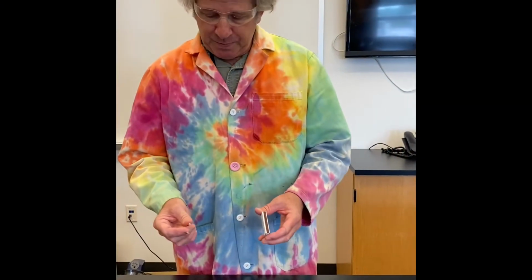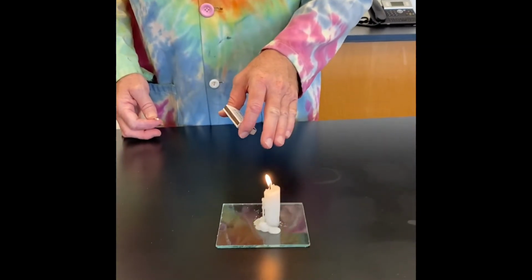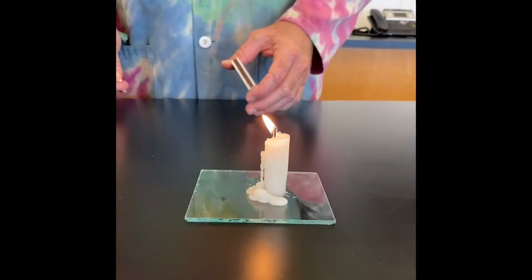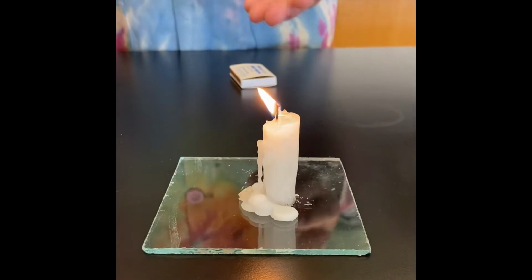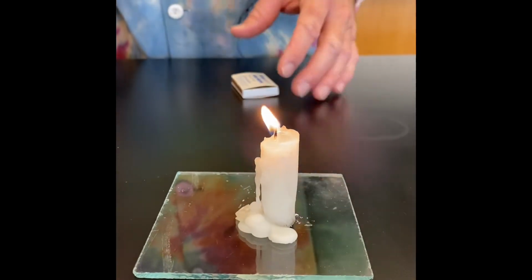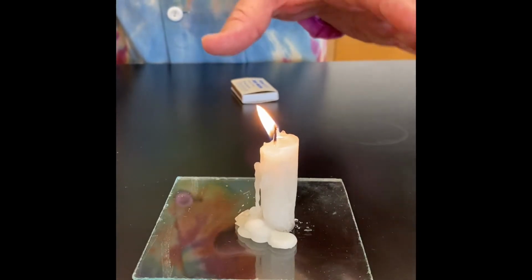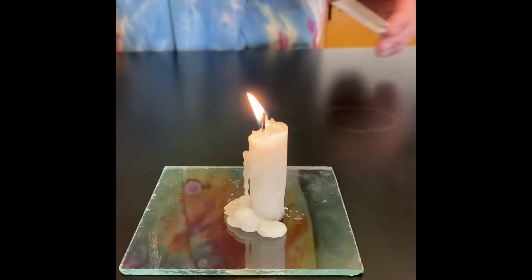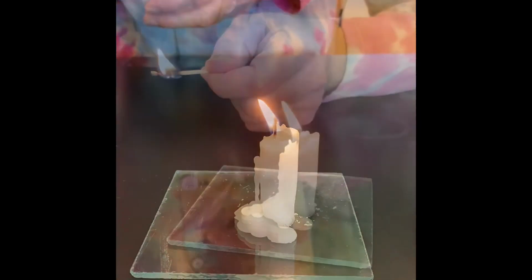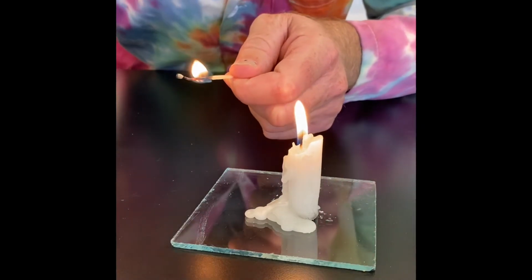Okay, my next step is I'm going to take a lit match and hold it up to the candle. But before I do that, I'm going to blow the candle out. And quickly, I'm going to hold the match up to the candle flame because I'm concerned about what is actually going on here, and is it just the stuff we could see, or potentially is something else going on here that maybe we can't see? So let's watch closely. Let's try that again.